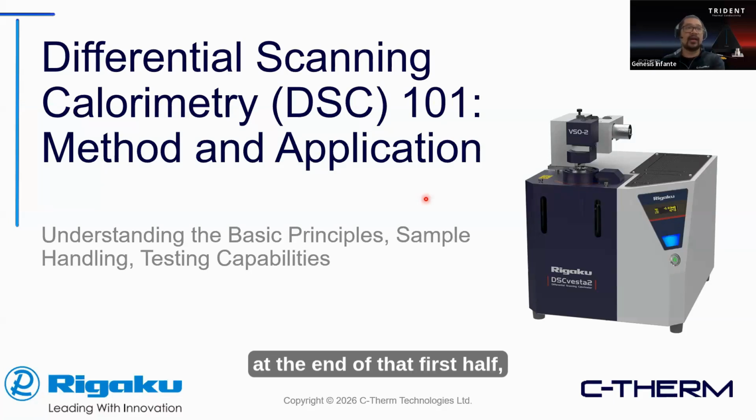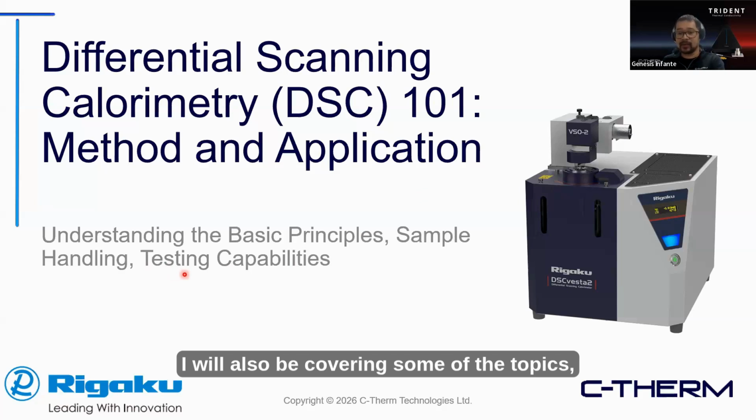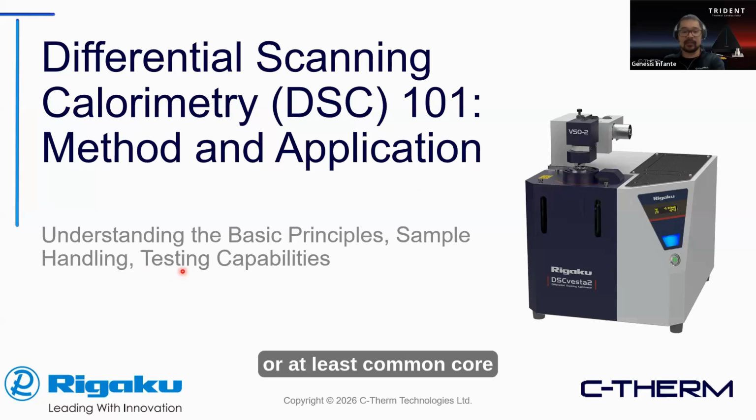At the end of that first half, I will also cover the common core testing capabilities done under the DSC technique.